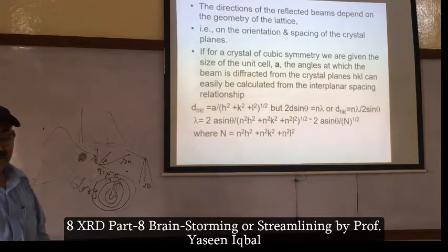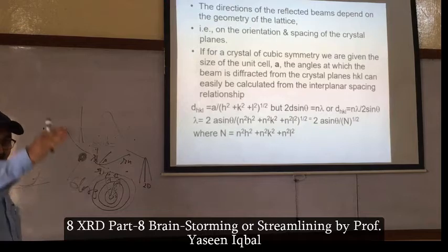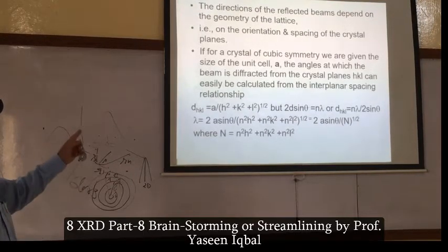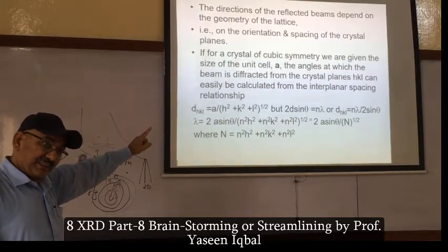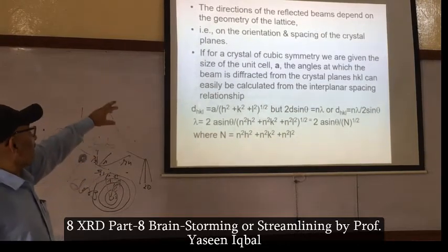Now, the directions of the reflected beam, the diffracted beam, depend on the geometry of the lattice. That is, on the orientation and spacing of the crystal planes. The orientation and the spacing between the crystal planes.